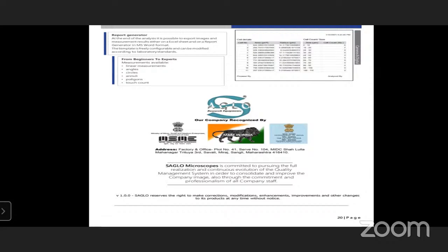You get the distributions and by using this data our software generates a distribution graph. Actually, I have not given it here, but it generates the distribution graph, and that distribution graph you have to export into your Excel. Okay, so all over the software मध्ये मी मगाशी म्हटल्याप्रमाणे 3% व्हेरिएशन आहे.